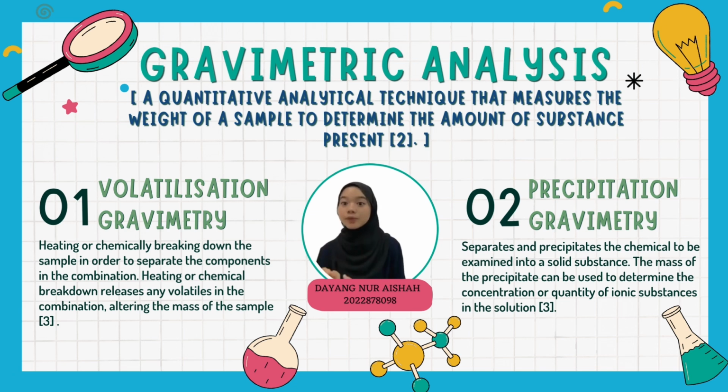There are two types of gravimetric analysis, which are volatilization gravimetry and precipitation gravimetry. What is volatilization gravimetry? Volatilization gravimetry is by heating the sample or breaking it down chemically for the components in the combination to be separated. Any volatiles in the mixture are released by heating or chemical breakdown, changing the sample mass, which is then measured.